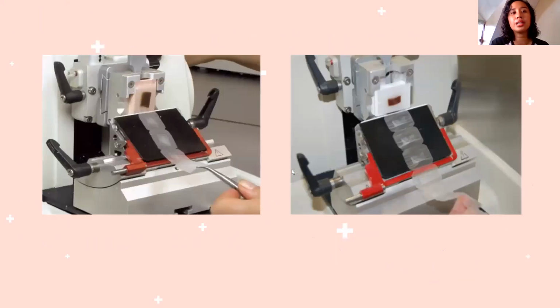So just to have an idea, look at these tissue blocks. Itong mga tissue blocks, guys, nilagay na siya sa microtome. So you have to trim it first so that it will fit into your microtome. And notice, class, the orientation of your tissue. Ang nasa harap na siya agad. Okay? Madali na lang siyang makat. So once you cut a microtome, usually you turn the knob. Tapos akit baba yan.